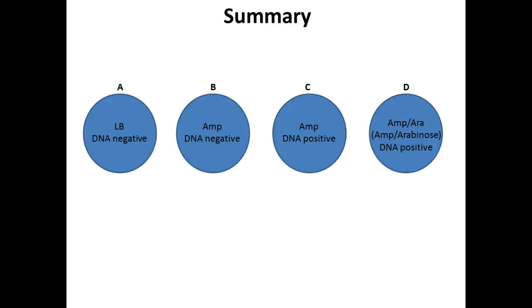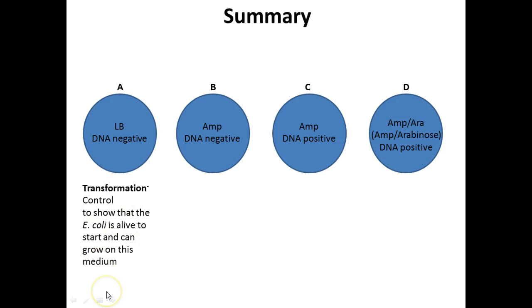So we have 4 little cute plates to work with today that I relabeled to match our ABCD here. Peter changed it up on me, but that's okay. So our first plate, right, notice DNA negative, and our second plate, DNA negative, right? This one is just the food, just the LB. This one is LB and ampicillin. So remember, this one we should have good growth. These are non-transformed cells. Right? This one we should have no growth, right? Non-transformed cells. Our other control to show that ampicillin kills.